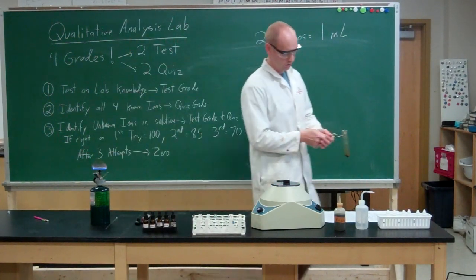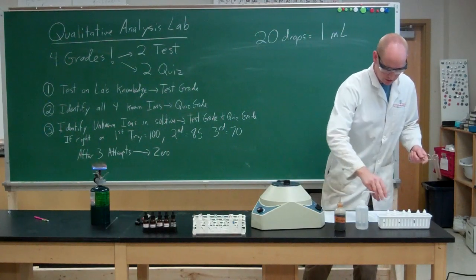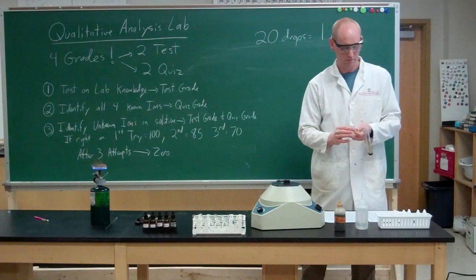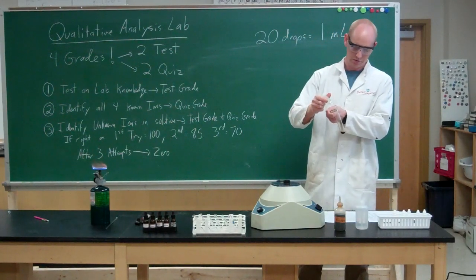So that's not too bad. I'm going to go ahead and add a little bit of hypochlorite to this.